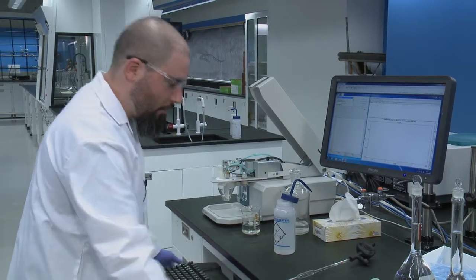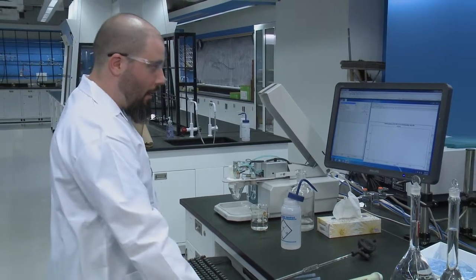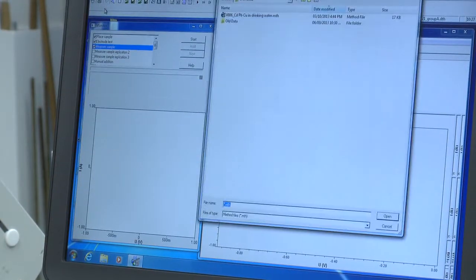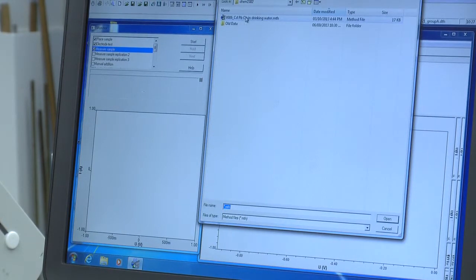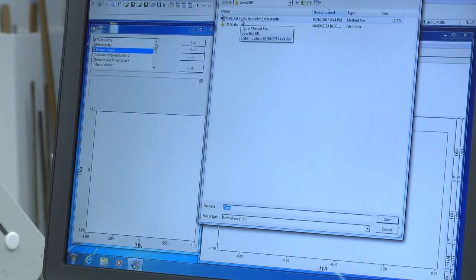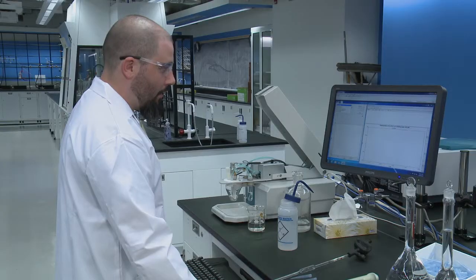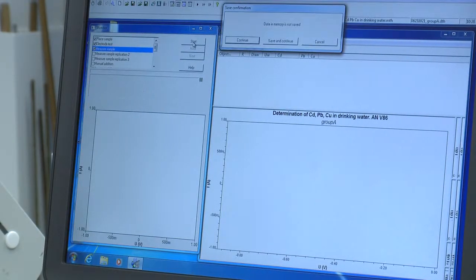And you'll want to start your run on the program. First you want to ensure that you have loaded the correct method. So if you go to file and load, select the cadmium lead and copper in drinking water method and open, and then click start, continue.